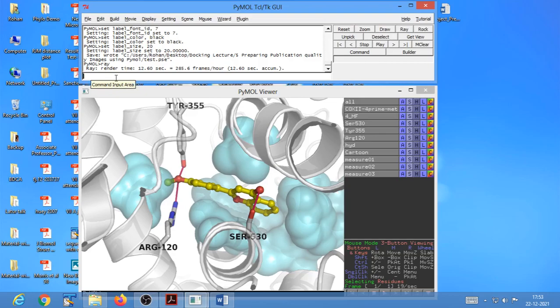Okay, now you can see that things have changed a little bit, right? You can see that there are shades over here. Some of the helices, its shade is shown on the surface, right? Here is the shadow of your ligand shown on this surface. So it looks really very beautiful, right?